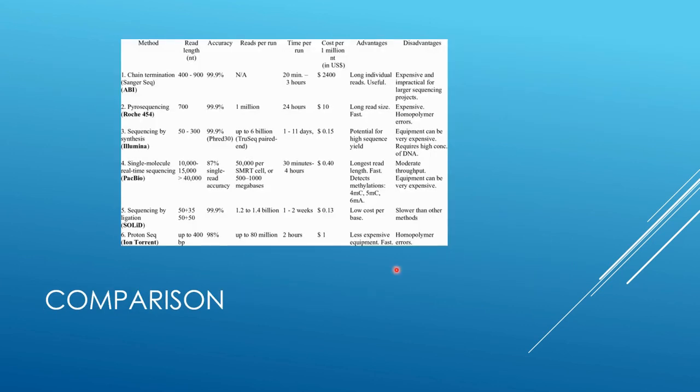So this is just a brief comparison of the sequencing techniques. As we said before, Sanger sequencing was the first method, followed by next-gen and Illumina sequencing, and more recently SMRT sequencing or PacBio sequencing. Each method has its advantages and disadvantages, with PacBio sequencing able to read really long reads and also at very good accuracy with circular consensus sequencing.